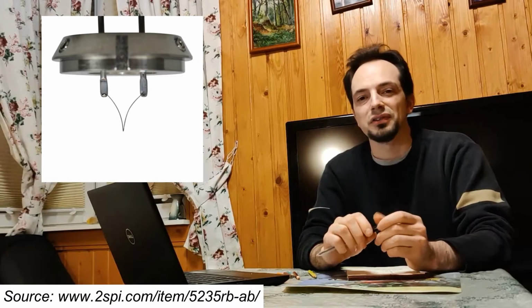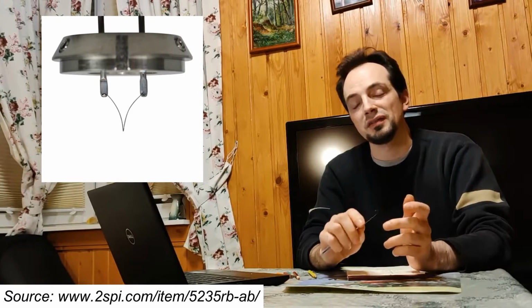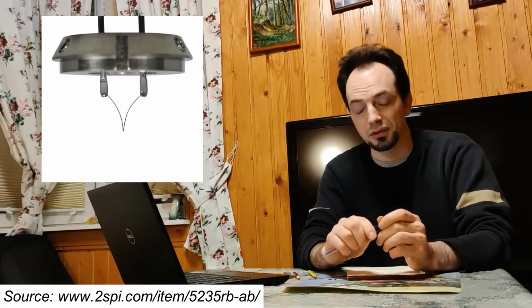This type of cathode is the least expensive one, the most simple one, but it gives not the best quality beam, not the best shape of the beam, not the best control of the beam, and so on.